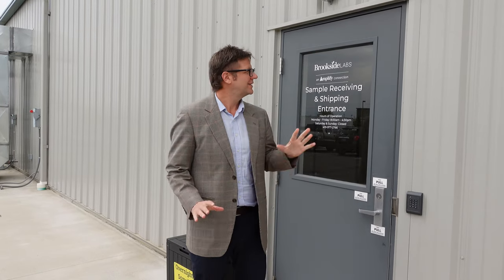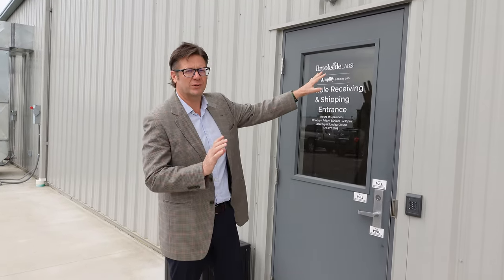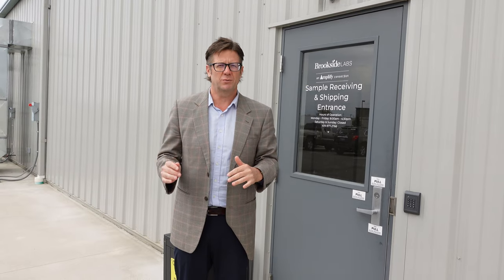Hi, I'm Micah Woods. Today I'm at Brookside Laboratories and I would like to show you what happens from the time a sample arrives at the laboratory and goes through all the steps to get tested for things like pH, soil potassium, soil organic matter, and so on. I am joined today by Liz Skinner, the soils lab manager. She's going to give us a tour. Let's head inside.